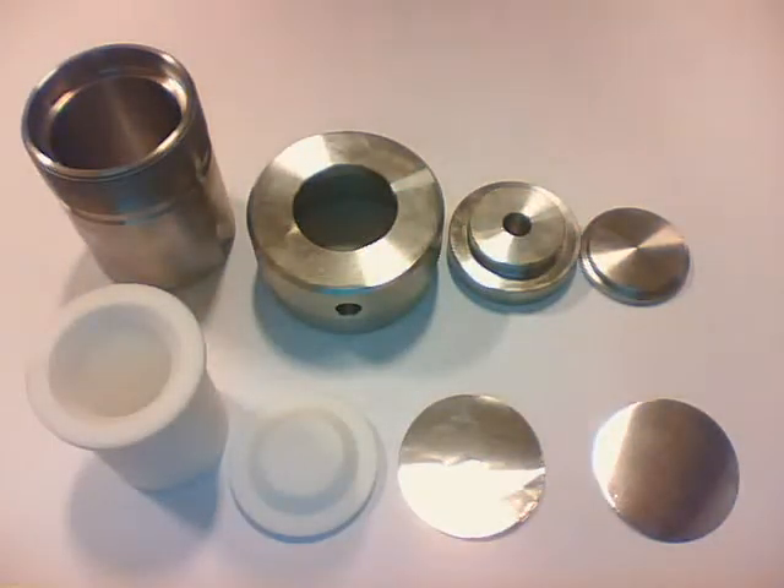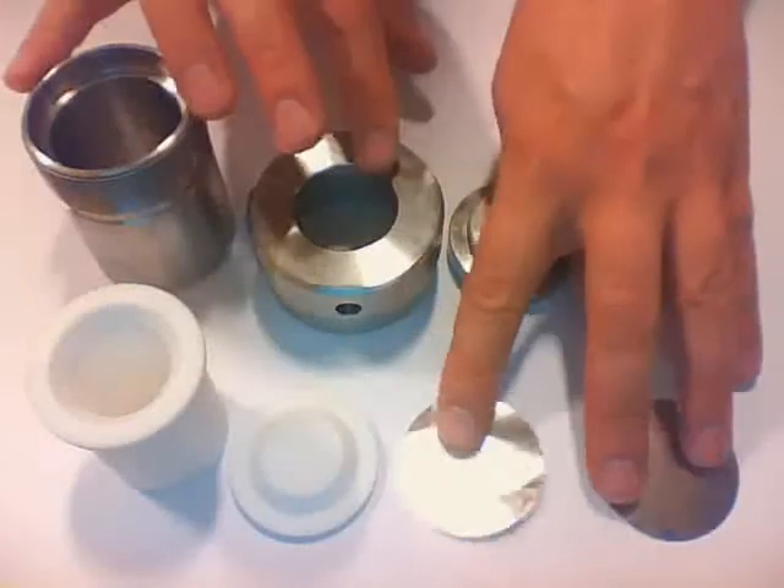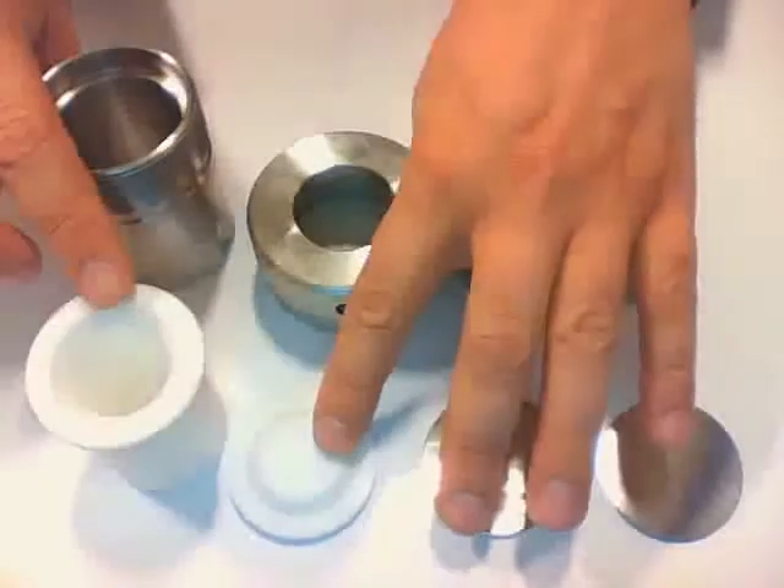In this short video presentation I'll show you how to use an autoclave. The autoclave you see here consists of eight different parts: six steel parts and two teflon parts.